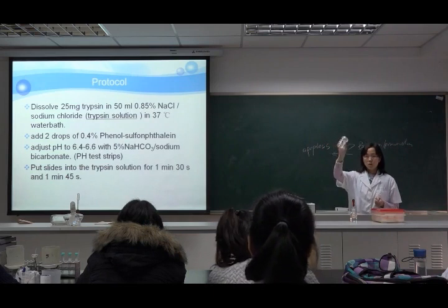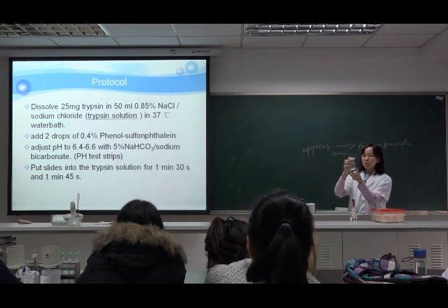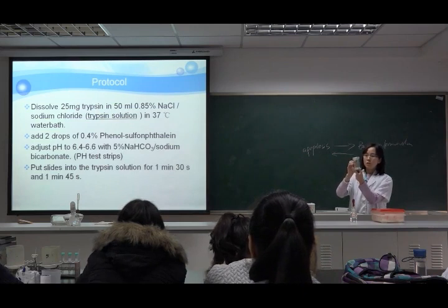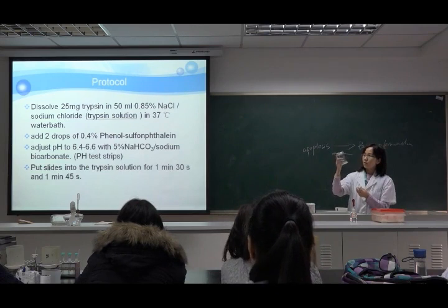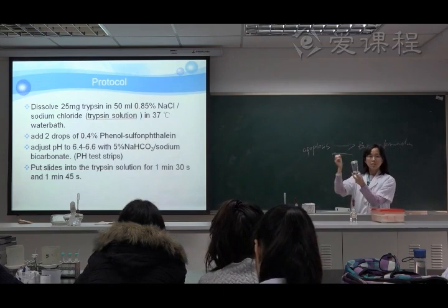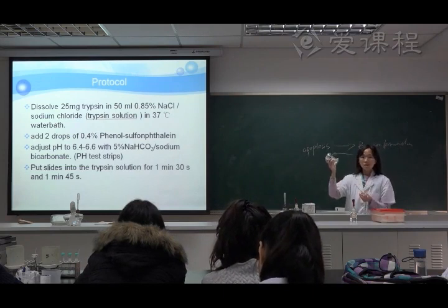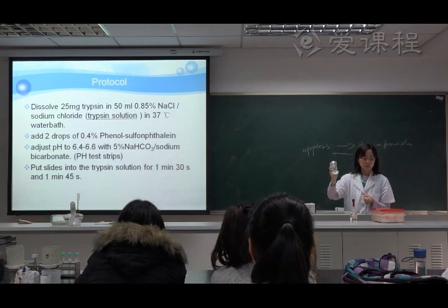That means we put the 50 ml of sodium chloride in here and add the trypsin here. Then we put it in the water bath at 37 degrees centigrade.